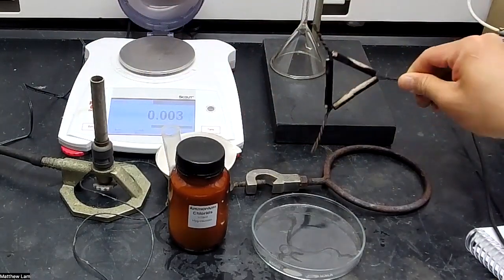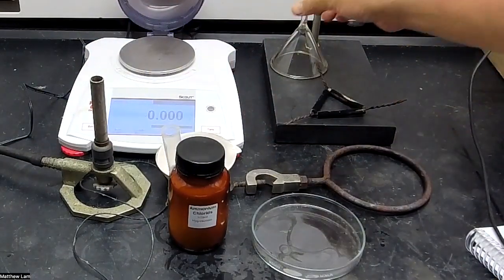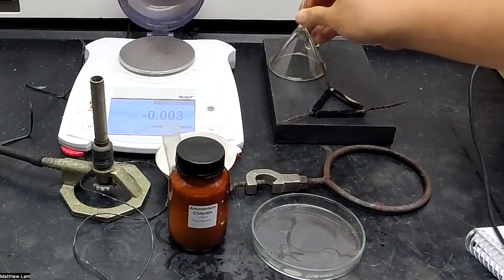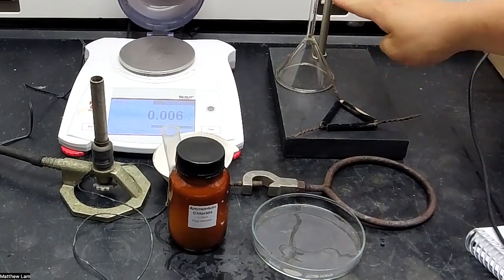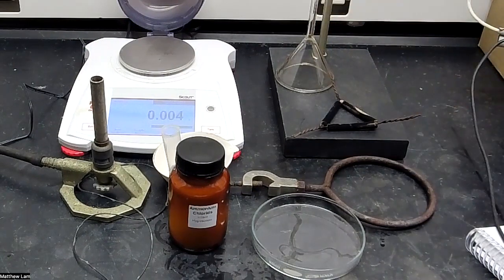We also have a triangle wire that I already pre-burned, a funnel, and a ring stand back here. You can't really see the top of the stand, but this is a ring stand. We'll see it later.